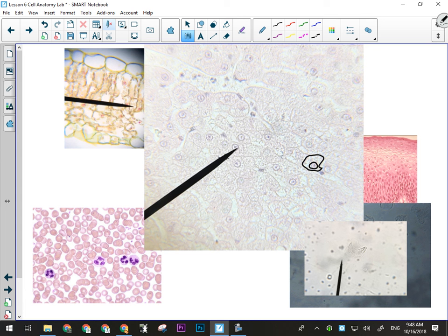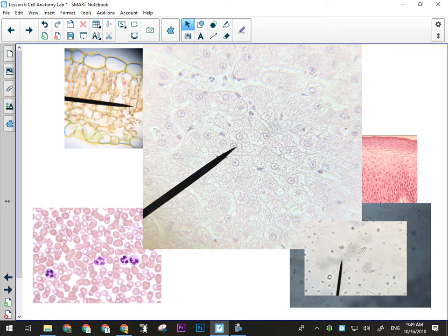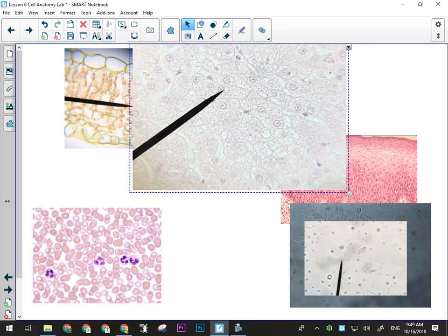And if you look closely at a lot of these nuclei, you see kind of on one side, they're kind of fuzzy looking. What would that be? That's the rough ER. If you can see the outside of the cell, that's the cell membrane, right? You can label that. Everyone kind of following what I'm looking for there? Again, you're not really using your imagination, but you're using your imagination, right? So it won't be this big when you look at it under the microscope. It'll be smaller than that, but just so that you get some idea of what to look for.